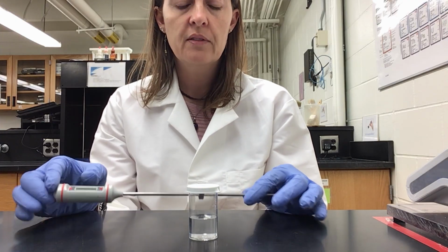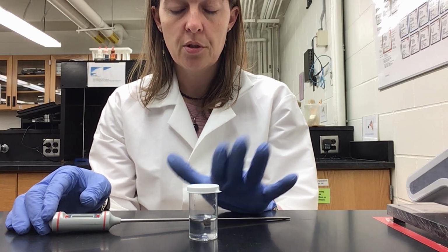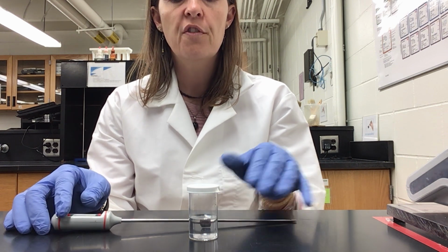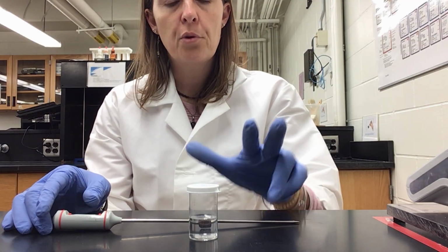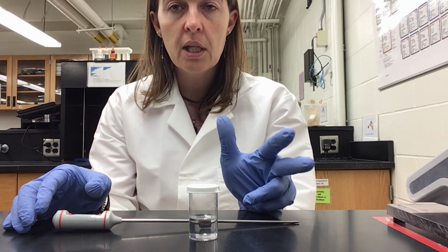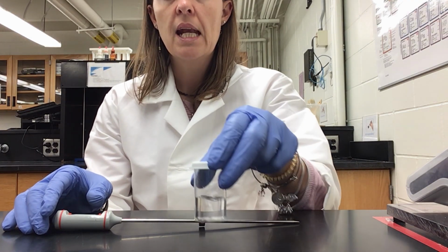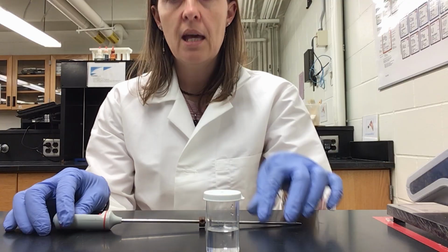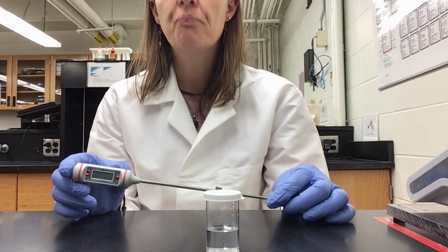need to measure the temperature of the water that you're going to measure. And you need to measure the temperature of each single trial. So you have 3 trials for 3 pieces of glassware, so you are going to measure 9 water samples, and therefore you're going to measure 9 times the temperature.